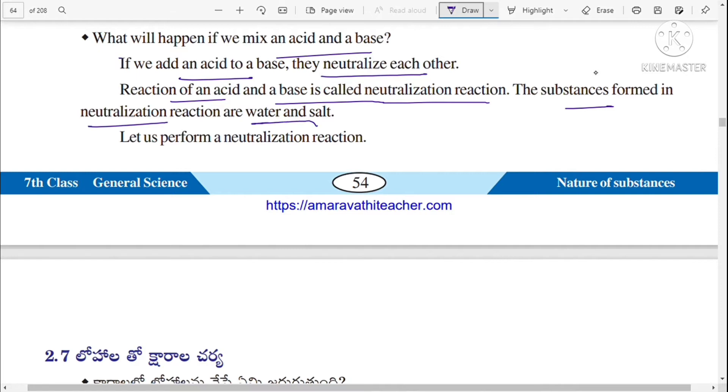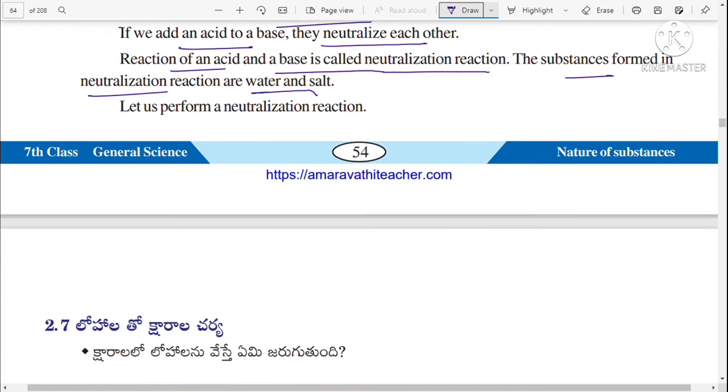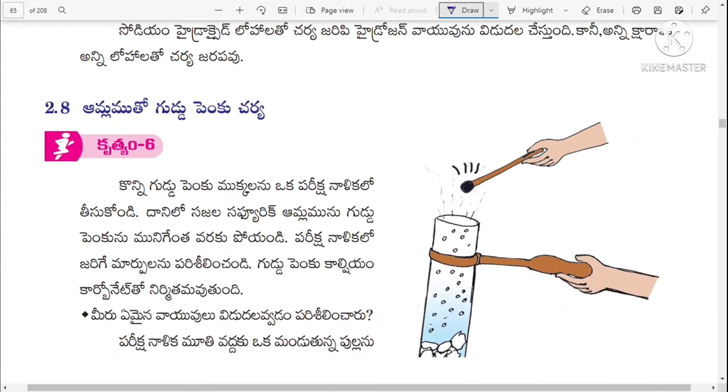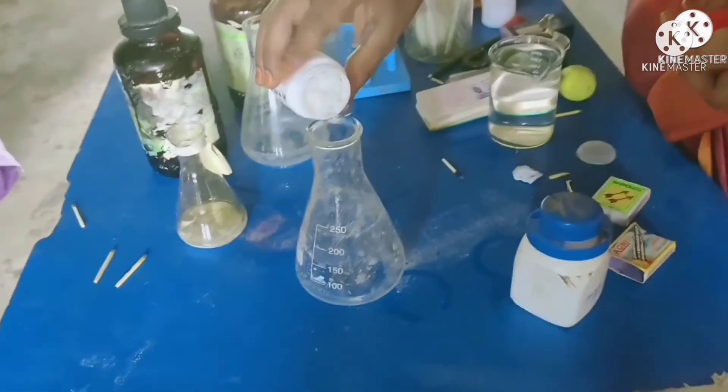When acids react with bases, it is a neutralization reaction, and the substances formed are water and salt. Let us perform a neutralization reaction. For this activity, we need some liquids.